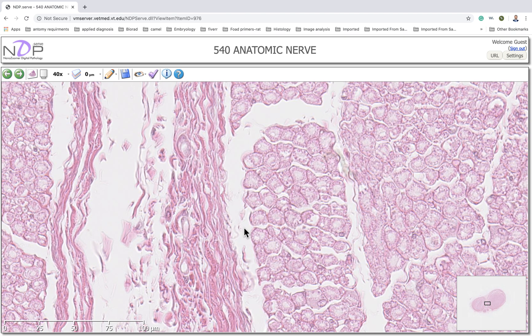The myelin sheath has the same component as the plasma membrane, which is lipoprotein. At this area here we can see the connective tissue called the perineurium, and the space between these bundles and the connective tissue is called the perineural space, which is usually filled with cerebrospinal fluid.